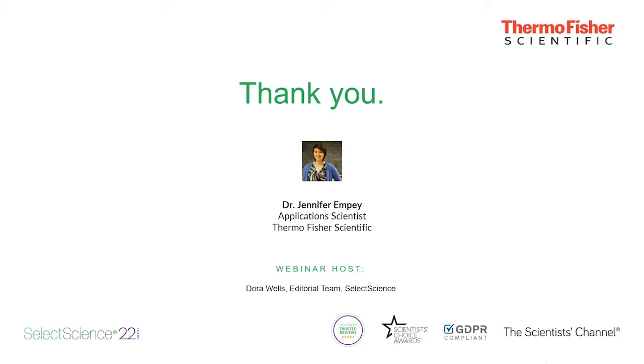Okay, cool. Thank you. And this next question, I think the first half has been answered already, but I will ask it anyway because the second half hasn't been answered. Can we analyse peptide aggregation, and what are the limitations on the MW low limit? Yes, that's a good question. In terms of the exact lower limit for the molecular weight of your peptides in solution, I'm not sure specifically.